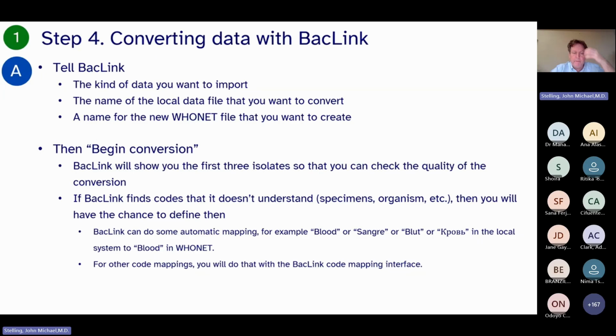WHONET suggests a name. You don't have to use the name suggested by WHONET or by BacLink. You can give it a different name. The problem with the WHONET name is that it's a bit long. It will say, for example, Sweden, but you can delete it if you know where you are. But you'll see that during the live demo. Then you say begin conversion.